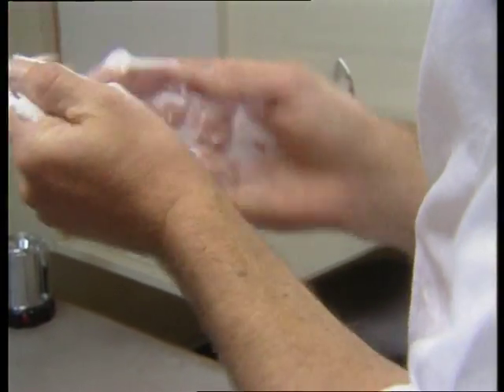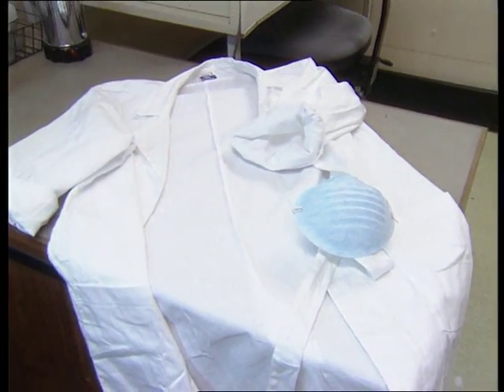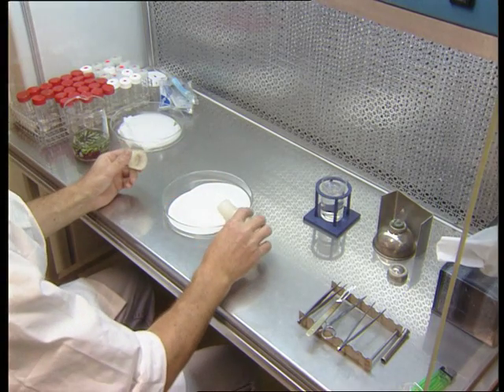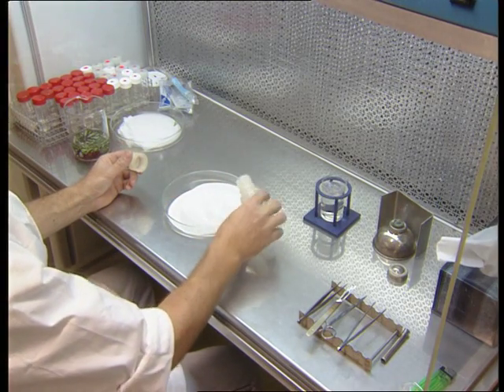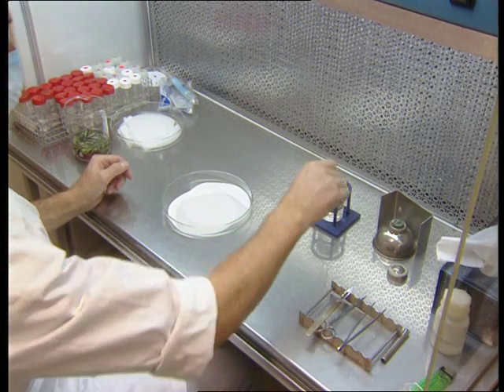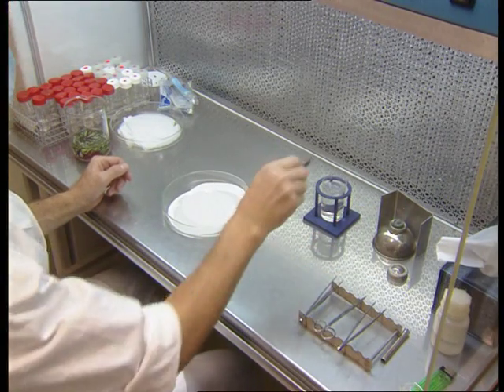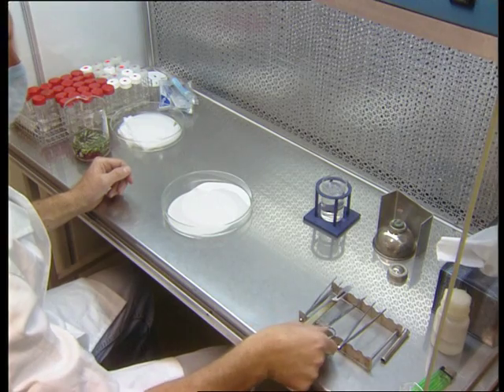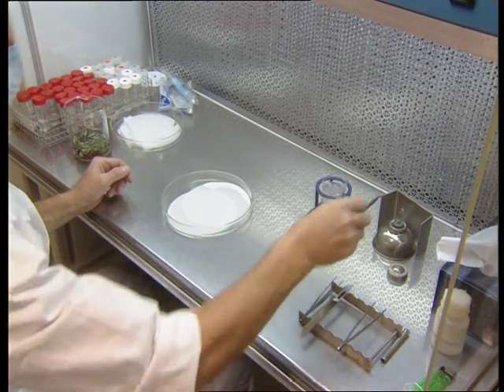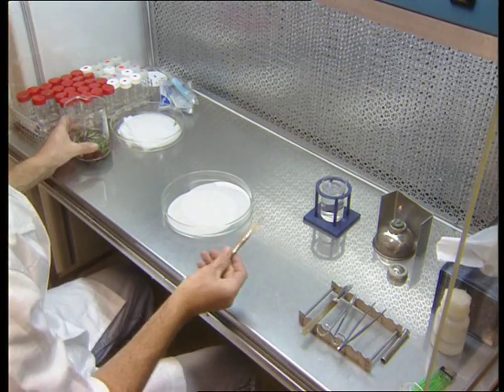A clean lab coat and a face mask will reduce chances of accidental contamination. The plant material, as a general rule, is cut to the desired size on a moist, sterile filter paper. It is important to note that any item used inside the laminar flow cabinet must be sterile — that is, the dissecting instruments such as the scalpels, scissors, forceps, and indeed the petri dishes or papers you use to cut the plant on.